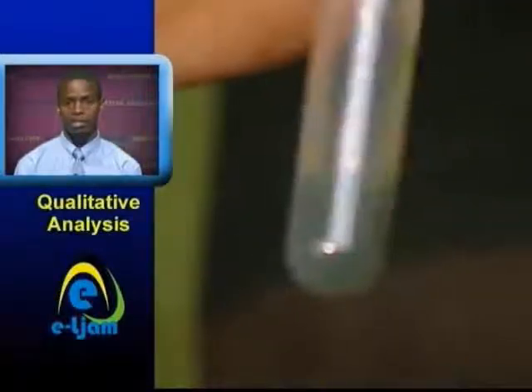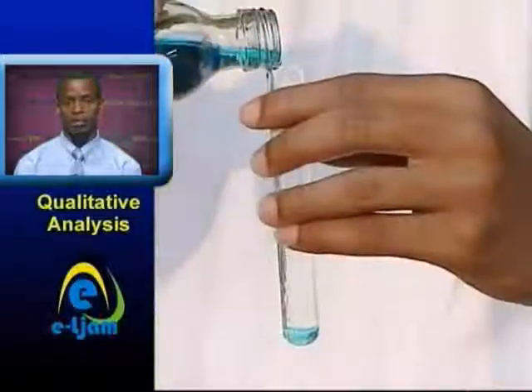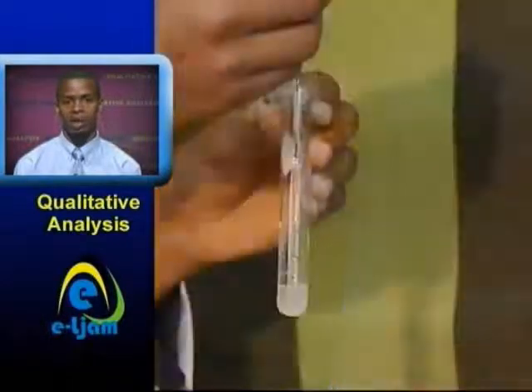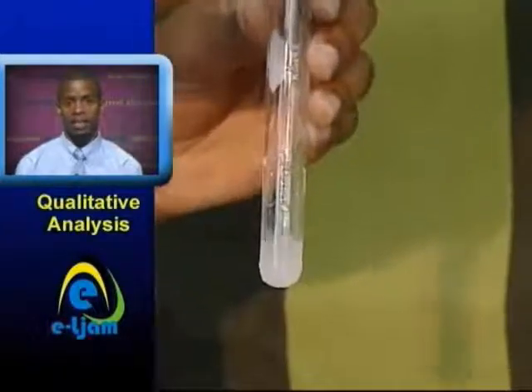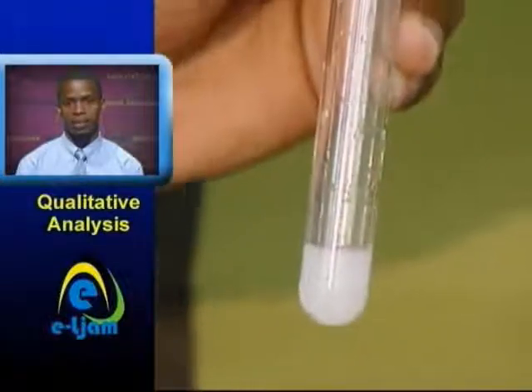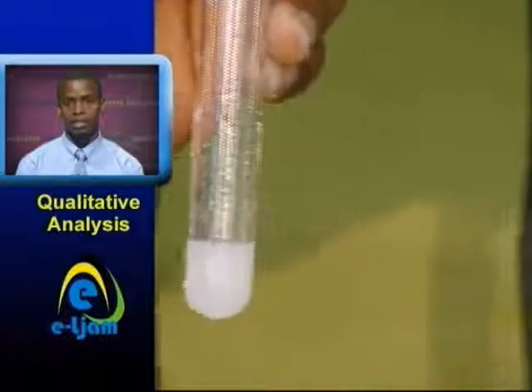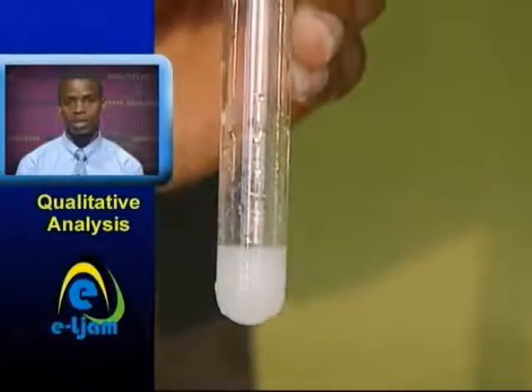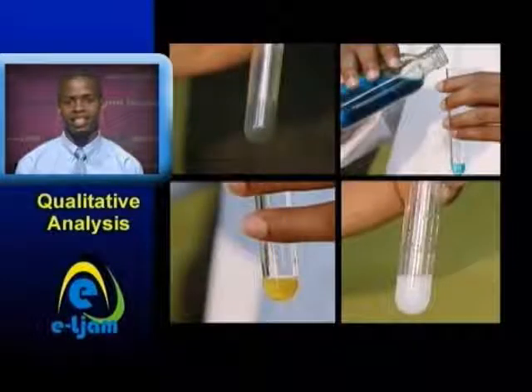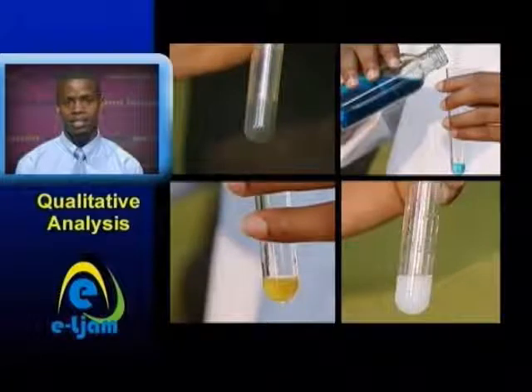Iron 2+ solutions tend to be green, copper 2+ solutions are blue, and iron 3+ solutions are yellow. If the compound appears as a white solid and its aqueous solution colorless, this indicates that the transition metal ions are probably absent, the notable exception being zinc, whose compounds are colorless in solution and white as solids. So you see, looks can be deceiving. Appearance is not a 100% effective guide in determining the identity of a compound.